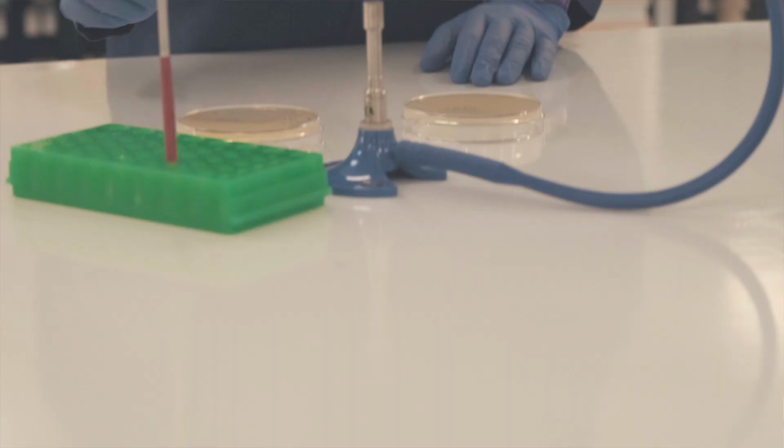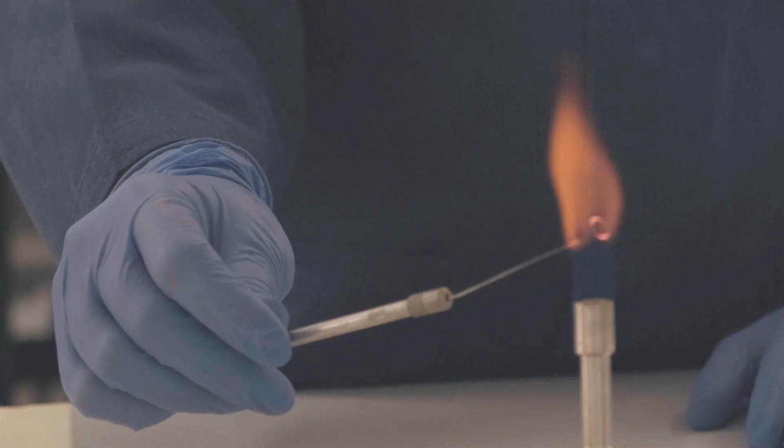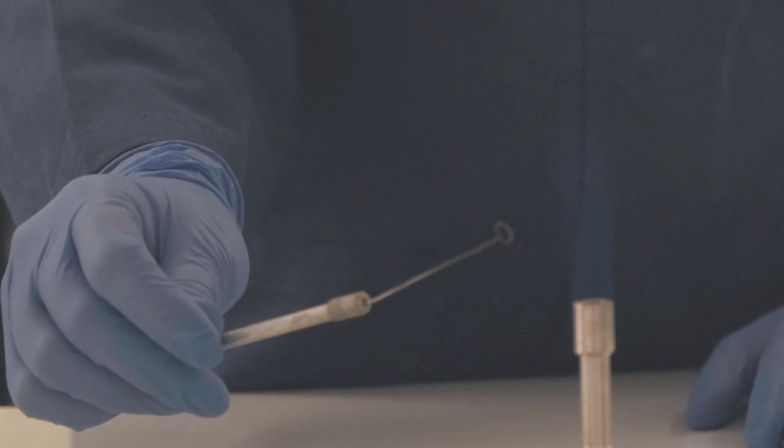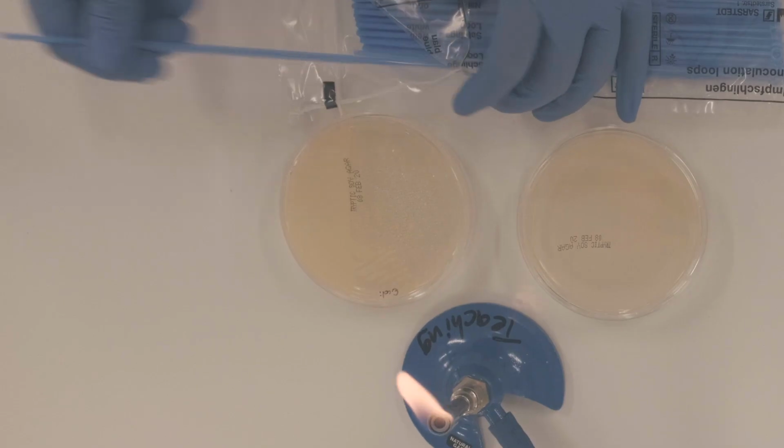We can use metal loops that need to be sterilized to transfer biological samples. Hold the metal loop at an angle in the flame until it is glowing hot. Cool it beside the flame for about 10 seconds before it is ready for use. You can also work with single-use items that have been pre-sterilized, such as pipette tips or spreaders. This is quicker to do but can be more expensive than a reliable metal loop that you can reuse time and again.